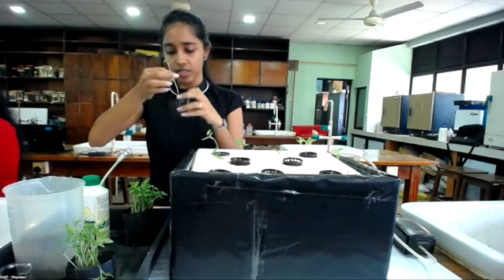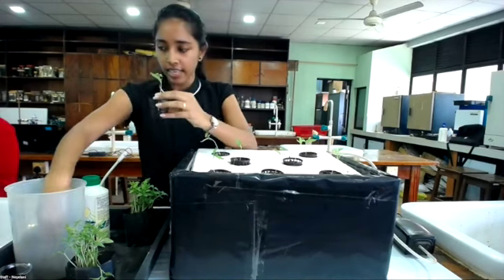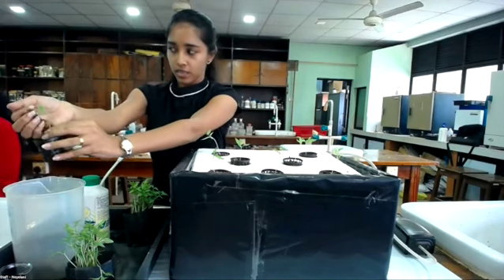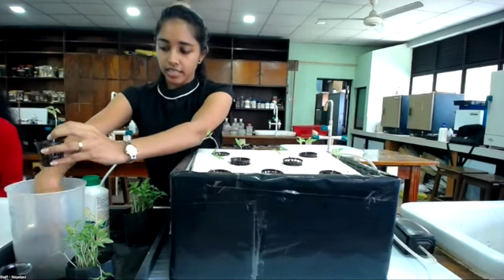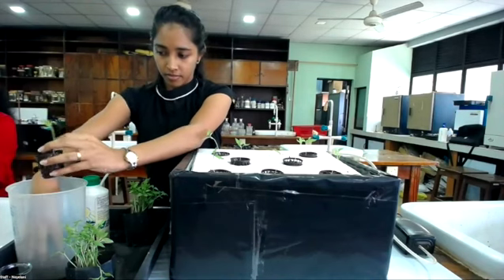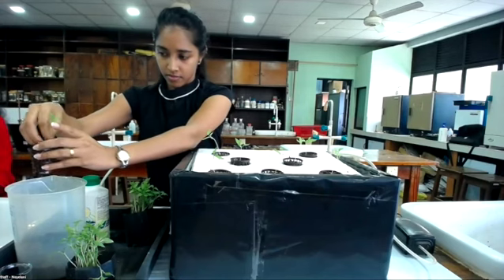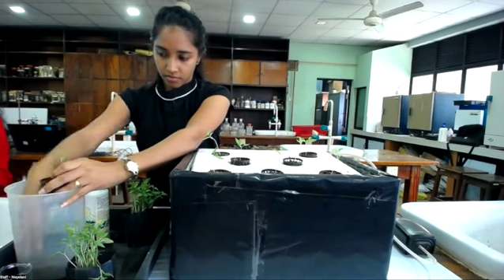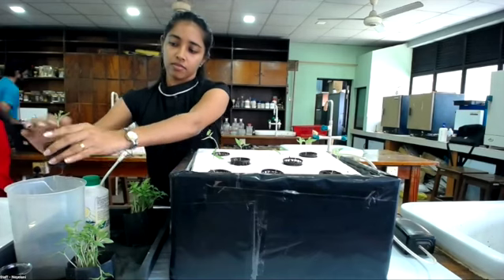Students, next we will start experiment number 9, setting up the hydroponic culture. Right? I think you can see this one. First, you want to have a pot with holes and some plants. Here we have set up plants, and I will show you one. First you can insert the plant like this, and we are taking coir dust as the supporting material.